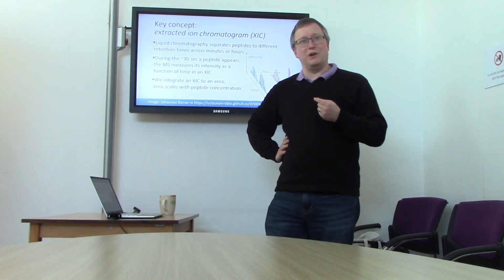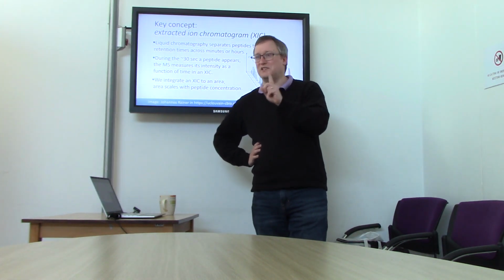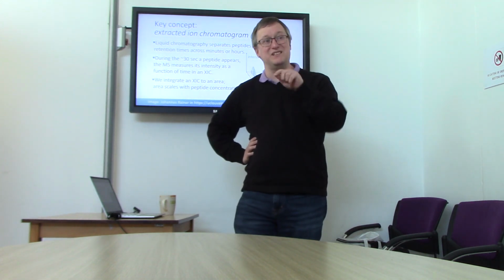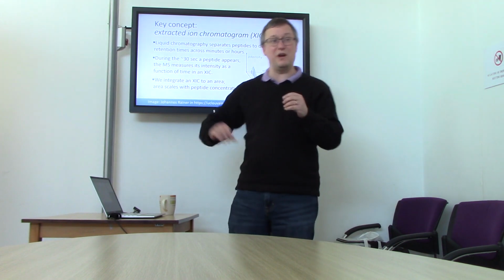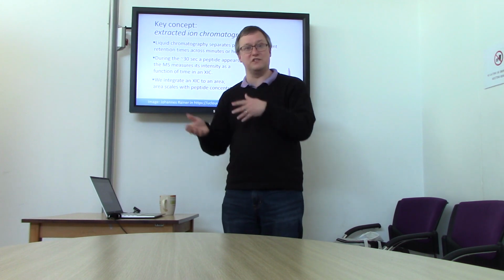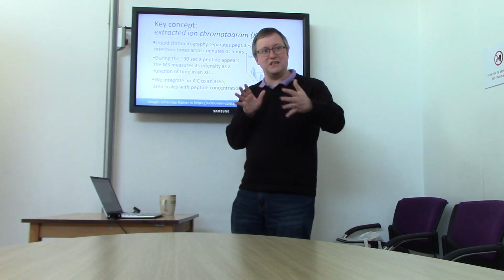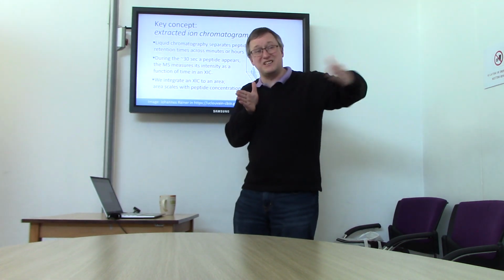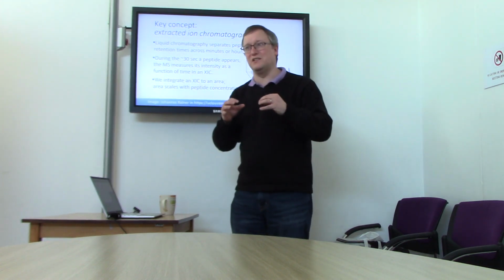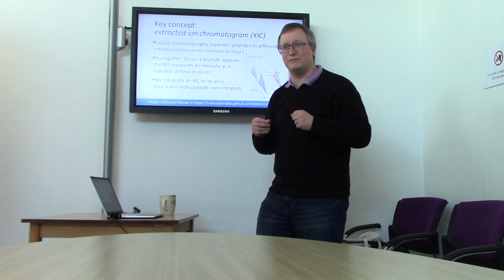What's the other thing that would show up here? Well, we would expect that we don't just have one ion representing each peptide. You would actually expect that each peptide shows up in different isotopic forms, right? So you have, say, 1% of all carbons are C13 rather than C12. As a result, you expect to see a pretty substantial amount of intensity showing up spaced out as isotopes in different XICs. So if you're trying to integrate the signal for this entire chromatogram, you'd really like to have all the different isotopes for it as well.